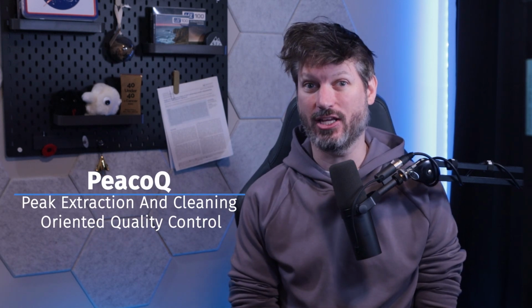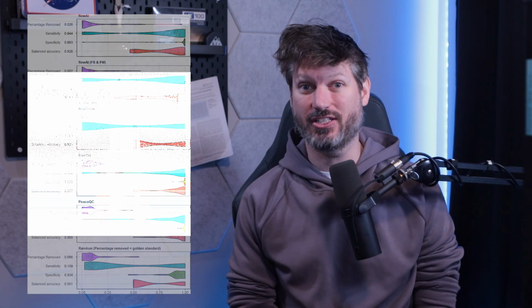There are a few really cool automated tools for cleaning up your flow data. You might have heard of a few: FlowAI, FlowClean, FlowCut. But I'm going to be showing you one of my faves, PeacoQC, or Peak Extraction and Cleaning Oriented Quality Control. I like it because it scales really well when you have a large experiment with lots of FCS files. It also has a high median balanced accuracy and works on CyTOF and spectral data, not just traditional flow.